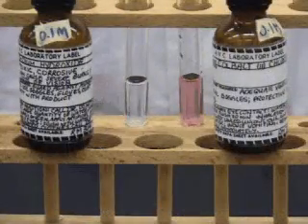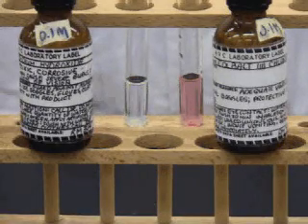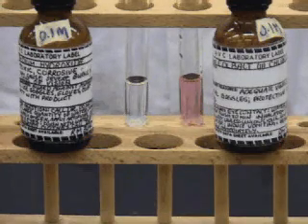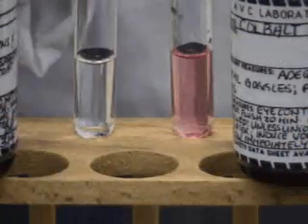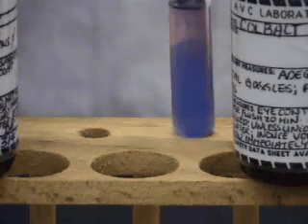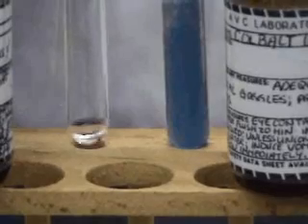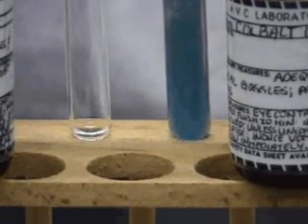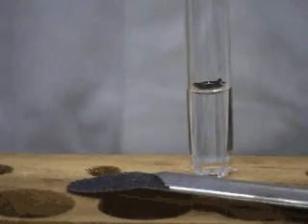Now we have sodium hydroxide solution on the left and cobalt 2 chloride solution on the right. Record your initial observations. And now we will mix those solutions. Record your observation.